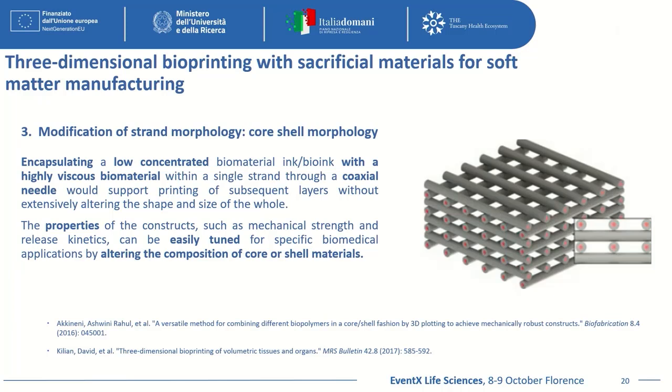If you want to replicate, for example, vessels inside a structure, so to replicate the vascularization, we can print the material for the vessel wall on the outside and then an inner core of sacrificial material that can be washed away when the outer core is correctly polymerized. So in this way we can print cavities inside a scaffold, for example.